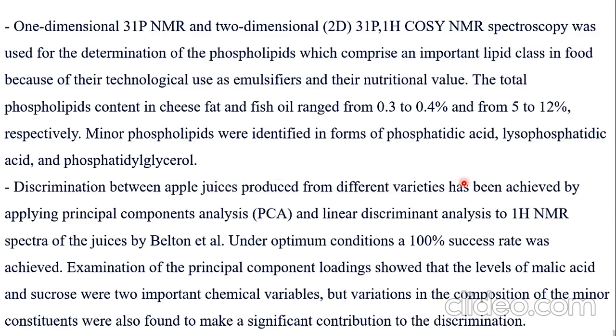So 1D NMR and 2D NMR, and 1H NMR spectroscopy are used in the determination of the composition of lipids and the classification of food by its vital nutritional value. Here is another example, as NMR also determines the quality control of apple juice.